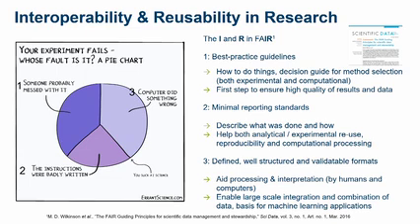So we need to describe what was done and how, and that helps both in analytical reuse and also computational processing. Last but not least, the computer might have failed to process your data. That usually comes back to using well-structured and validatable formats to get across this problem. If you have these formats defined, then you aid processing and interpretation by both humans and computers. And that is the basis also to enable large-scale integration and combination of data, and as a basis also for machine learning applications.